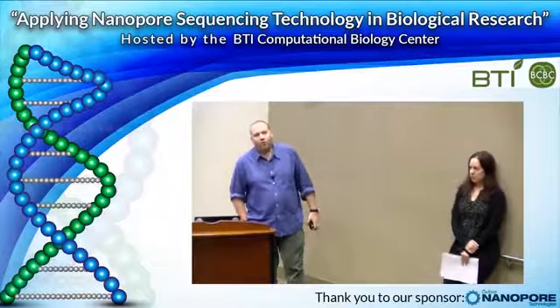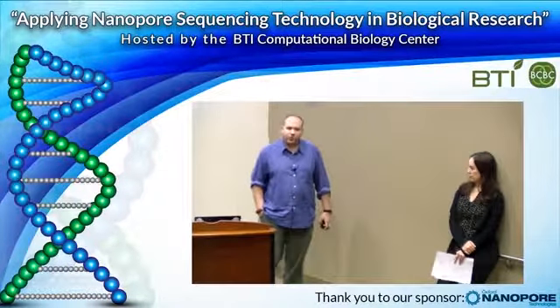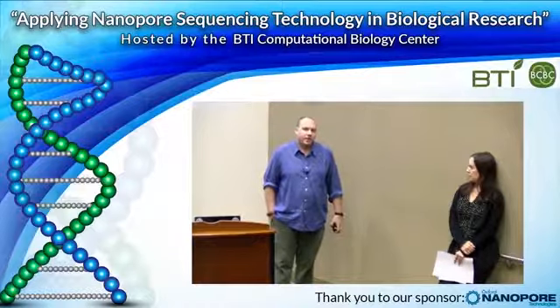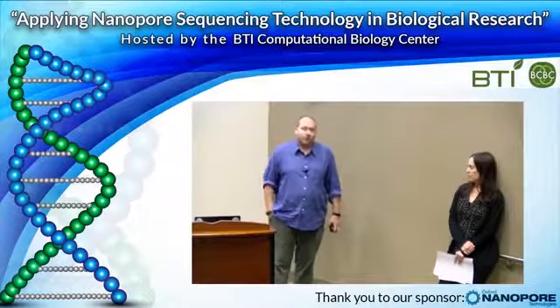I did try that, but we only had, for each species, about 3 million reads, and I tried to assemble just with that, and I was not getting good assemblies at all. The number of contigs was like 1,000 contigs. So I don't know for sure what was going on there. Something I need to look at.